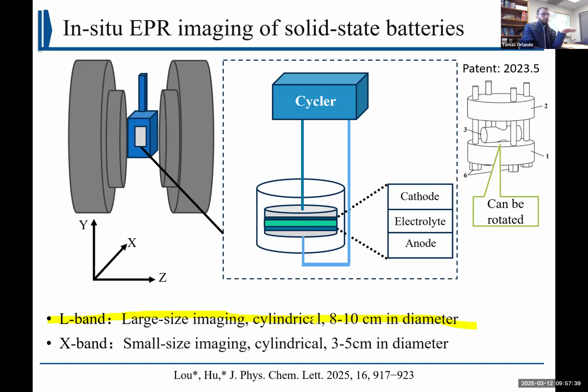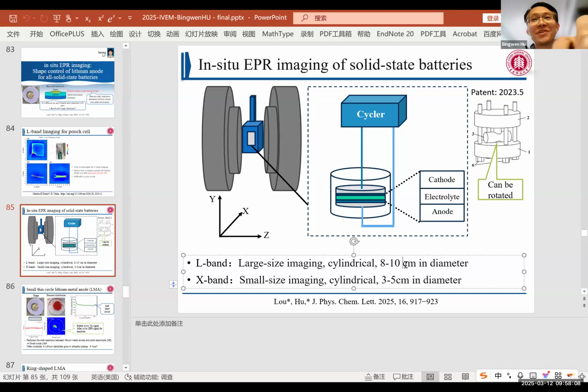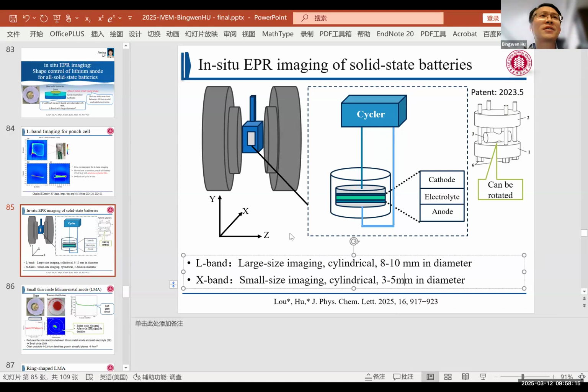And the magnetic field homogeneity is enough to cover this large area? Yes, because we tried experimentally in this range, roughly 3 to 5. Oh, sorry, it's a mistake. It's millimeter, not centimeter. Sorry. Oh, I see. Okay. I have changed the slide. Sorry, this is a mistake. We have tested experimentally at roughly 3 to 5 millimeters in diameter. We will get much better homogeneity in this machine. If the sample becomes very large, it's not so homogeneous. Okay.